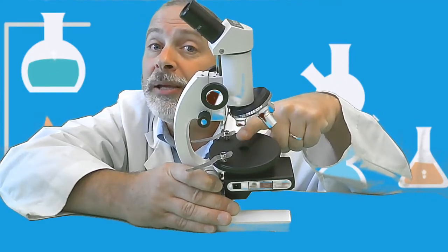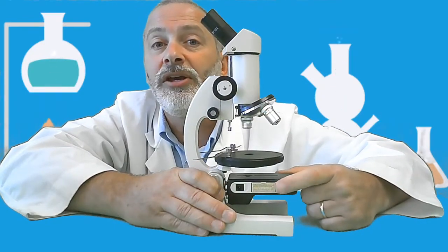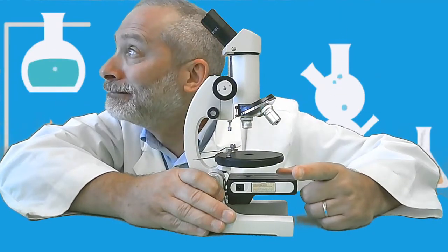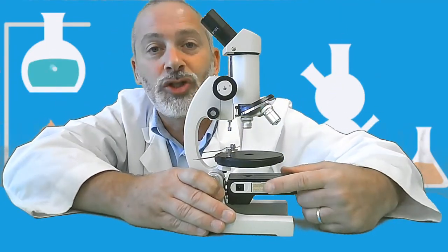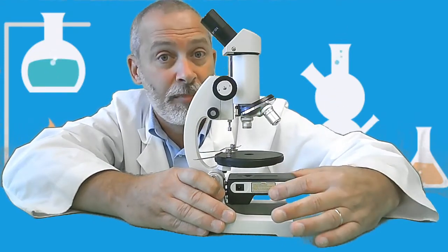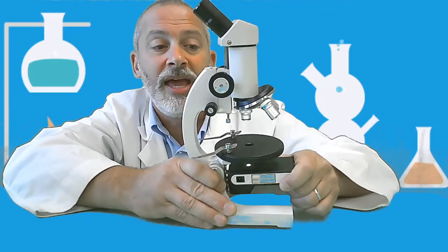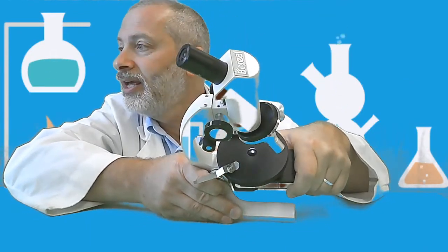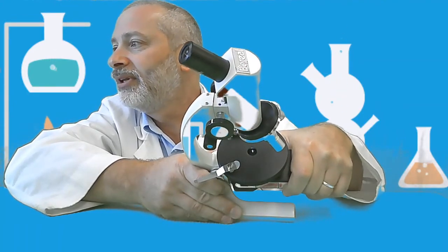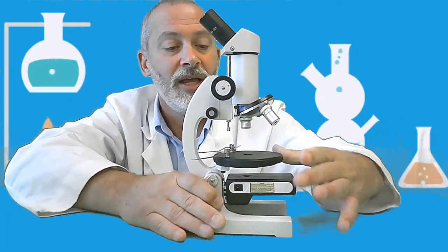And directly below the diaphragm, underneath the stage, we have here a, oops, I almost told you. What is it, everybody? A light. Yeah, this is a light source. With this particular microscope, it is a lamp, not a mirror. But this lamp can turn on, and it can be adjusted, and it can turn off. I don't know if you can see that. We'll definitely see it later on, but that is the lamp.